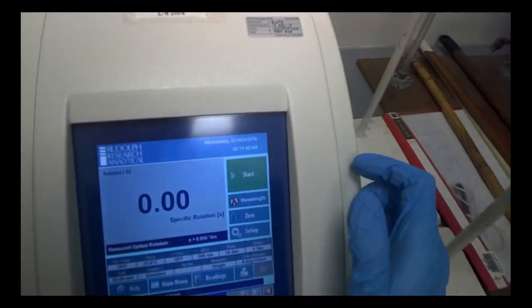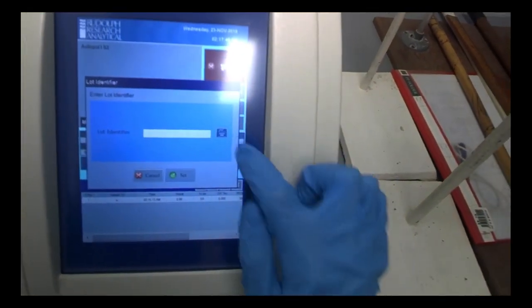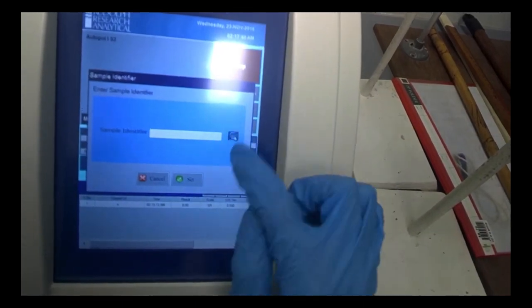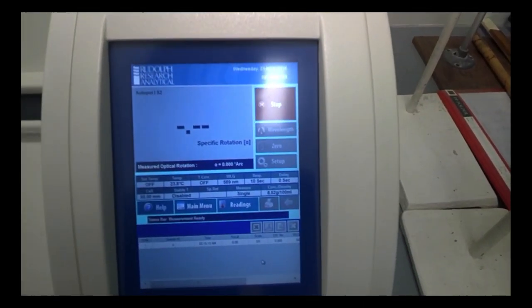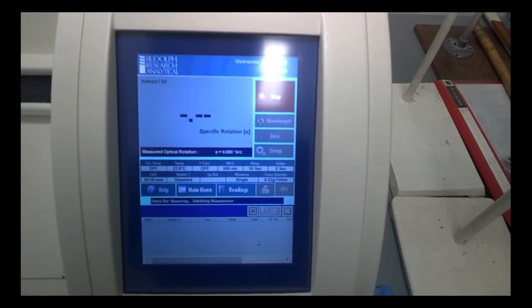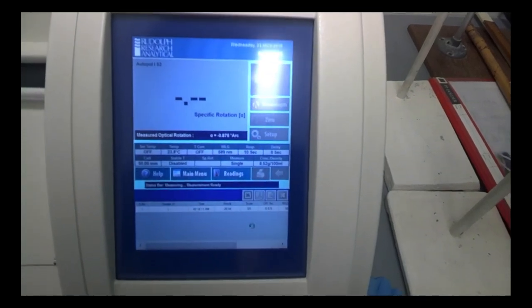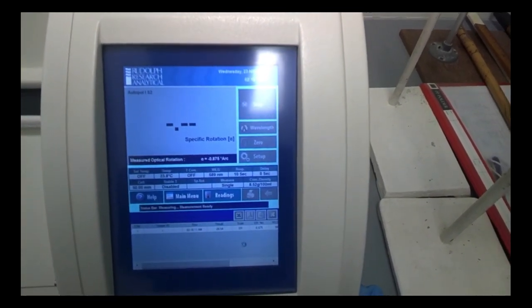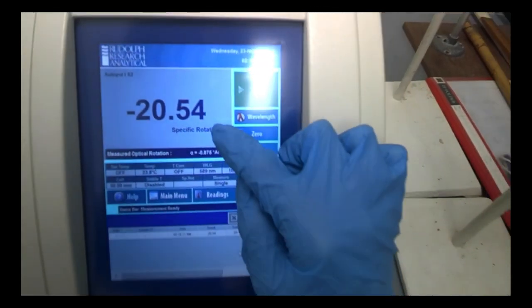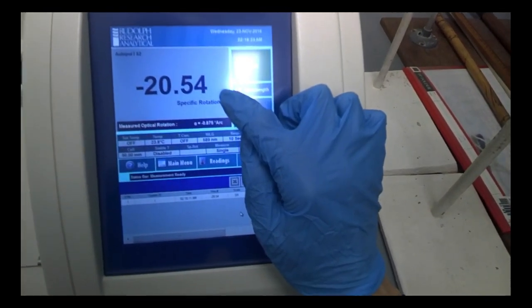Close the door tightly and now we press start. Again, same thing, identify it using a letter. The reading should come up soon, it's running there. Here you go, so that's the value you can take note, the specific rotation.